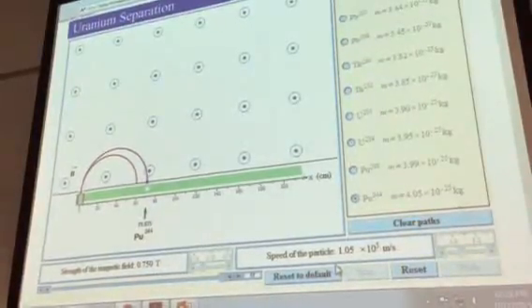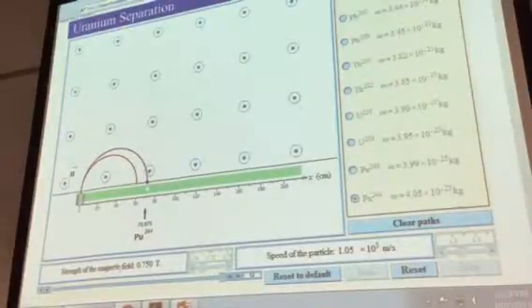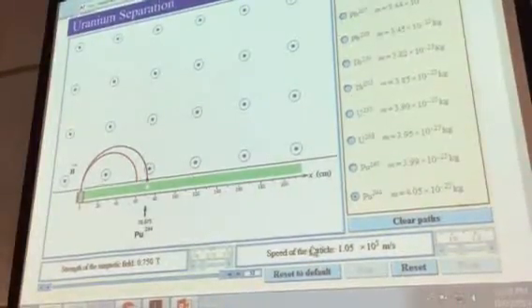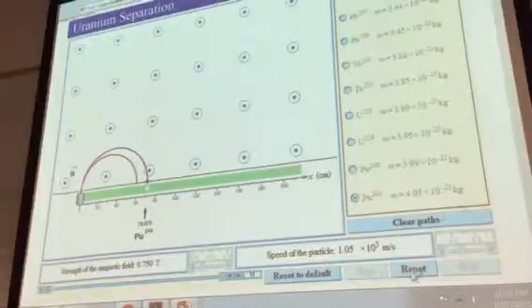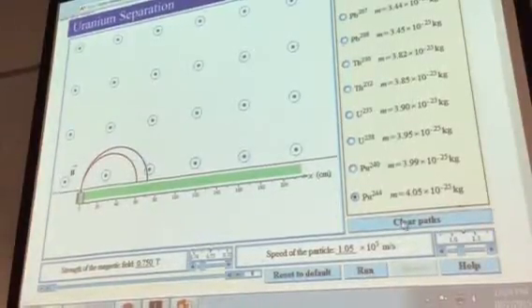Everybody good? And so, let's see, it will not let you vary any of the instrument parameters once you get those set without deleting the previous traces, the previous runs. Right? I don't think it will. Will it? Oh, yes, it will. Never mind then. So let's do this. Just to give you an example.